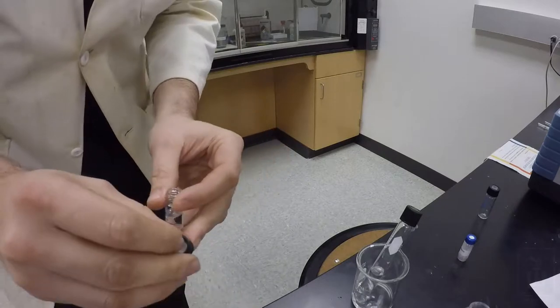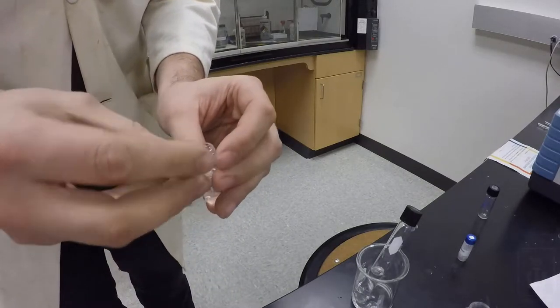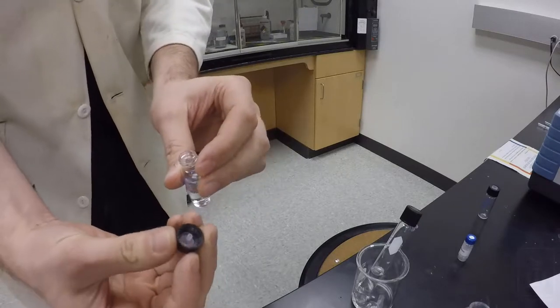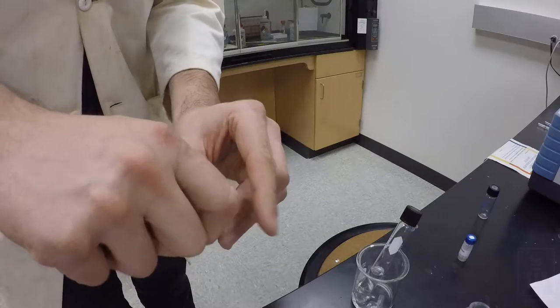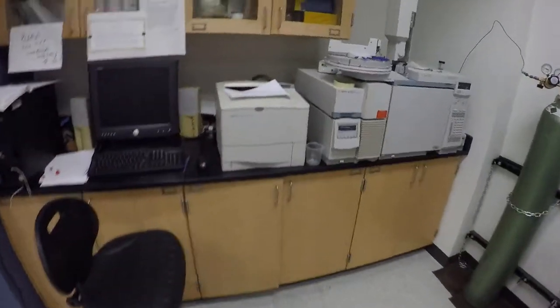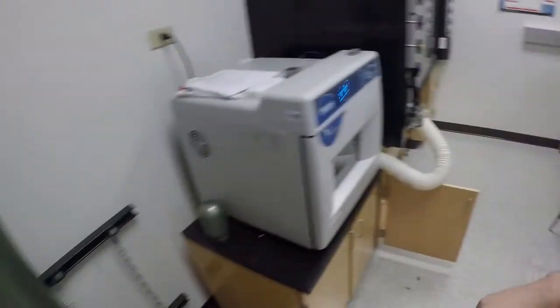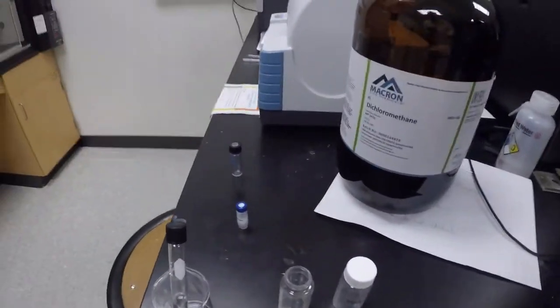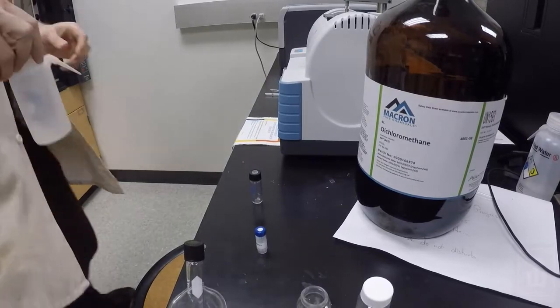And you want to be careful that you don't lose this little white septum in here. That's what prevents it from evaporating too fast. That can fall on the ground and it's really hard to see because it's already clear. So make sure that stays intact. And then I'm going to go over here and put it into the solvent A slot. And then I'm going to do the same process for methanol in our other vial.